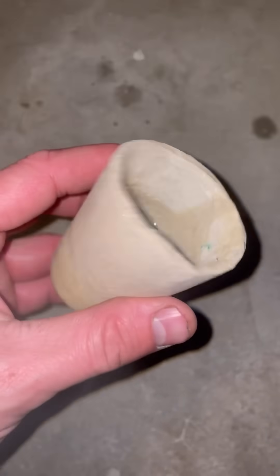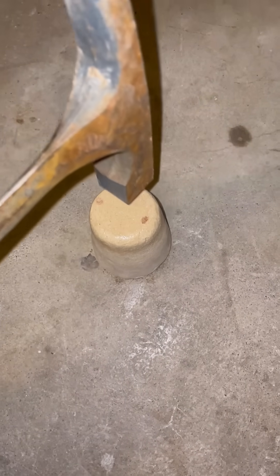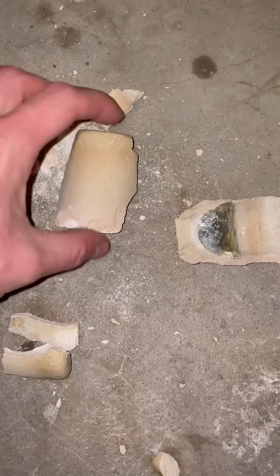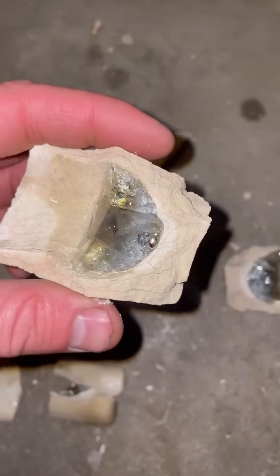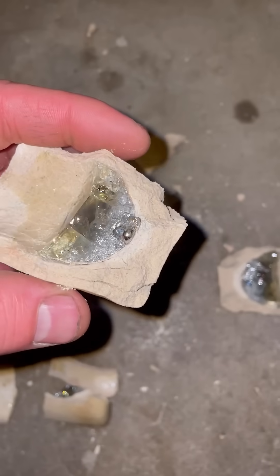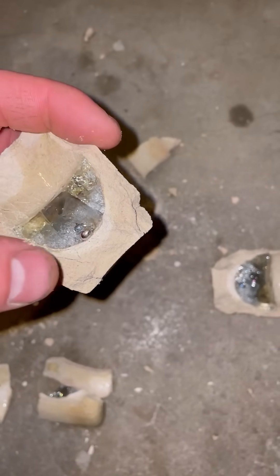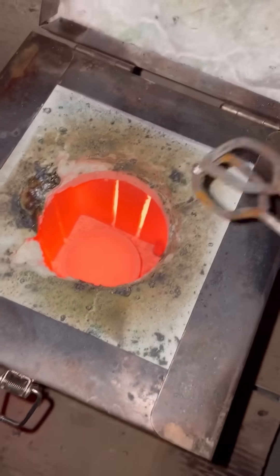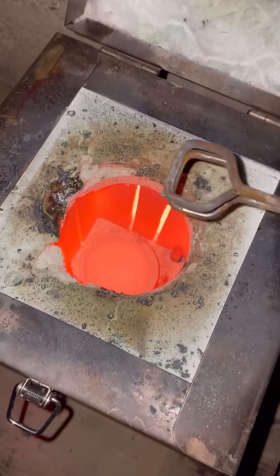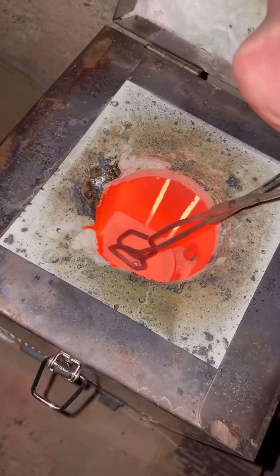It's cooled off enough that I can handle it. Let's destroy the crucible. There's my bead of metal, which is bismuth with hopefully a little bit of gold dissolved into it. A little hot on the inside there. Okay, here's the bismuth — I'm going to drop it right down into the cupel.